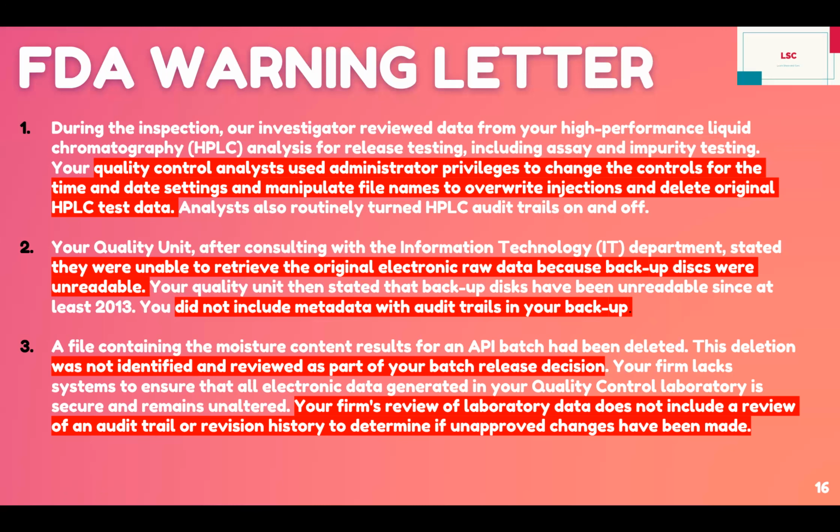Now, a file containing the moisture content result for an API batch had been deleted. This deletion was not identified and reviewed as a part of the batch release decision. Your firm's review of the laboratory data does not include the review of an audit trail or revision history to determine if unapproved changes have been made.